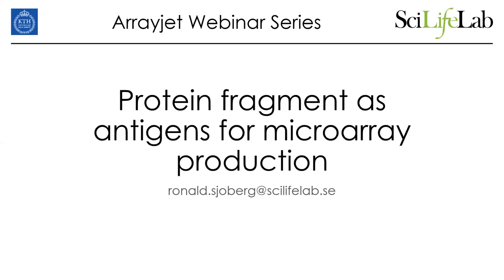Now, my name is Ronald, and I'm head of facility here at the Autoimmunity Profiling facility in SciLifeLab. And I will talk a little bit about the protein fragments that we use for the production of our microarrays and how we use them.